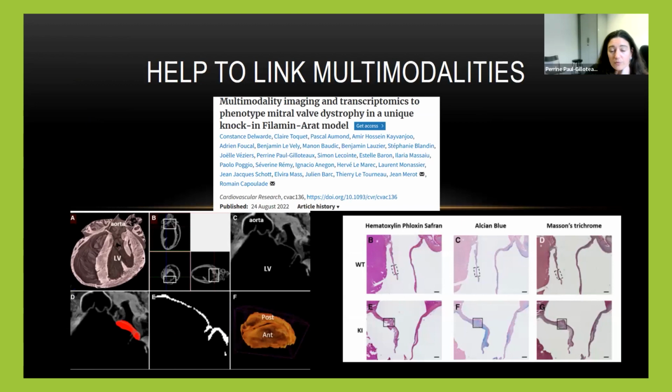That's also a question that we had when you want to do correlative microscopy. You're going multimodal, and sometimes you may want to add a step, or sometimes a step does not exist, so you need to develop a system to add a step linking different modalities.